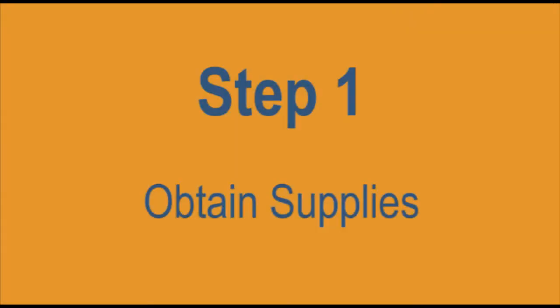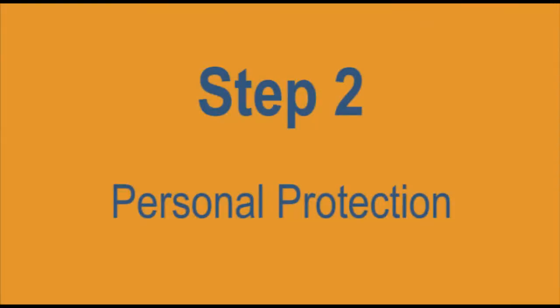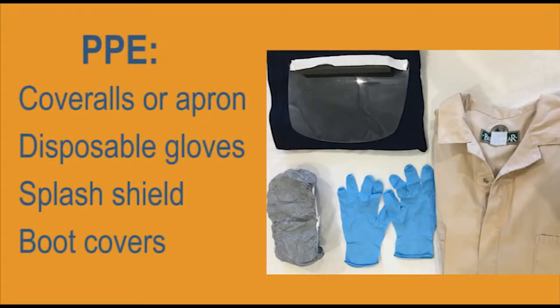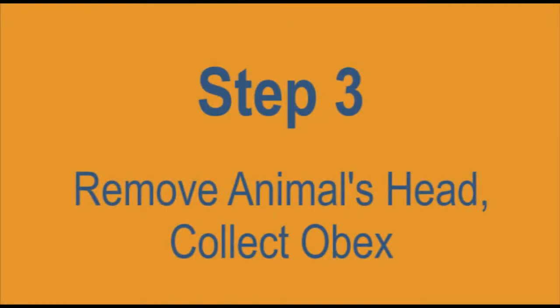Step 1. Obtain supplies. Step 2. Personal protection. Step 3. Remove animal's head, collect obex.